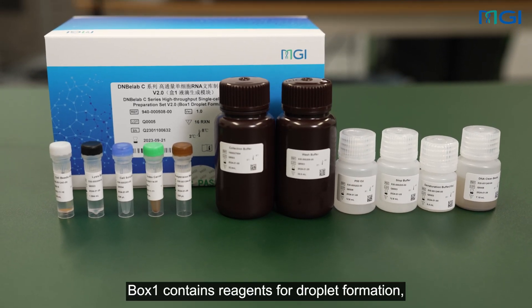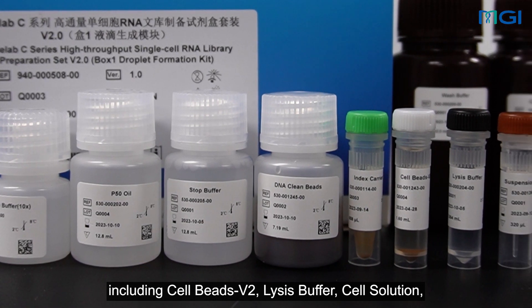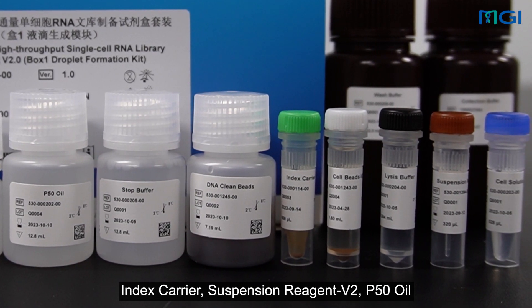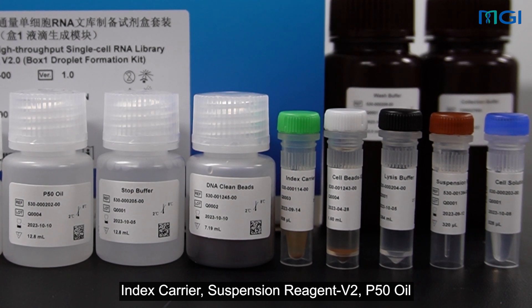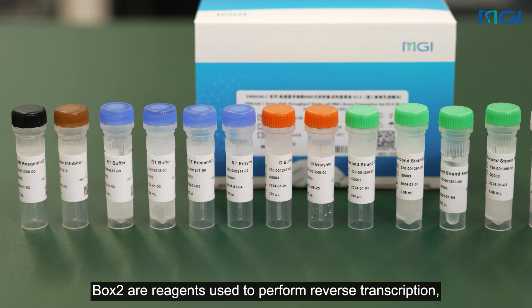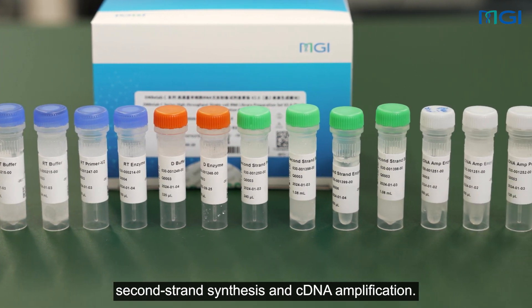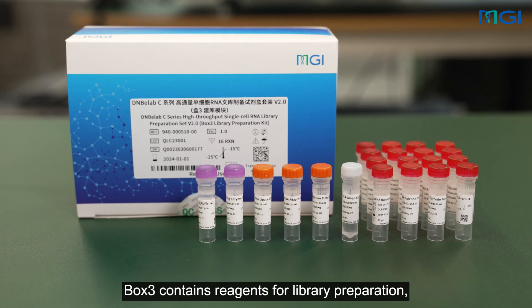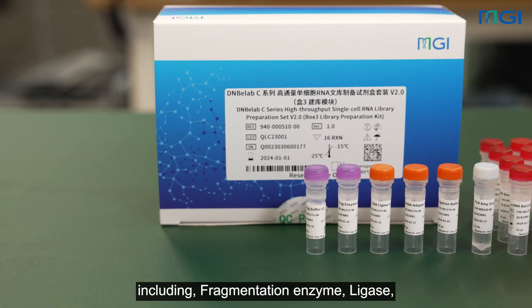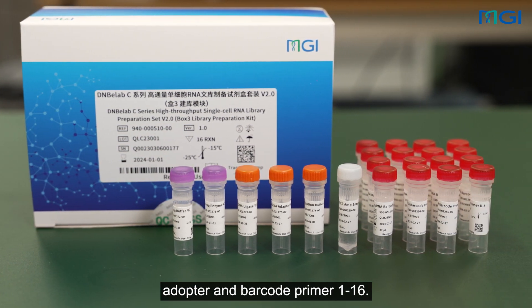Box 1 contains reagents for droplet formation, including cell beads V2, lysis buffer, cell solution, index carrier, suspension reagent V2, and P50 oil. Box 2 contains reagents used to perform reverse transcription, second strand synthesis and cDNA amplification. Box 3 contains reagents for library preparation, including fragmentation enzyme, ligase, adaptor and barcode primer 1-16.